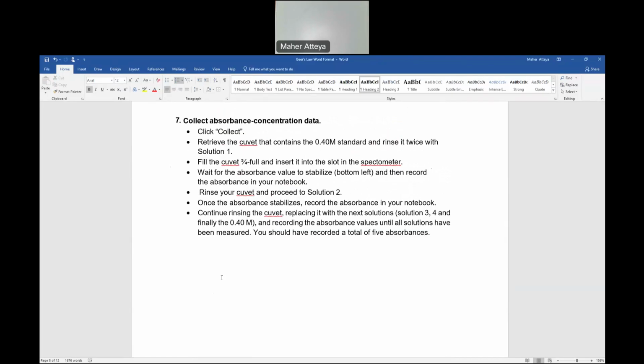So the stock solution, maximum wavelength like this. The solution in beaker number 1, the absorbance is this. So get yourself a scratch paper, or write all those things on a piece of paper, just in case something happens to the software while you are doing the experiment. Correct?